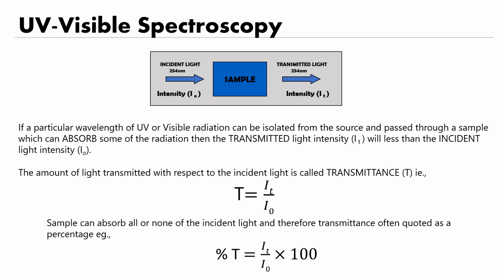Okay, you understand? Suppose we strike the sample with light of a particular wavelength and intensity I0, suppose 100% of the light is striking the substance.